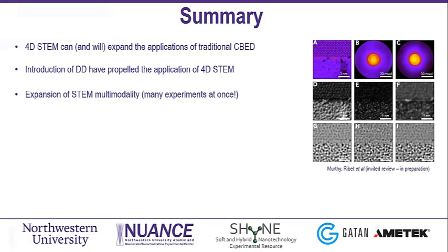One nice feature that I really like to show is that with 4D STEM, we can definitely expand the STEM multimodality. STEM itself is already a multimodal technique. You can collect EDS, you can collect EELS, you can collect cathodoluminescence and others with different detectors. But by collecting those diffraction patterns, you can definitely create different visualizations and unlock different information from your sample.